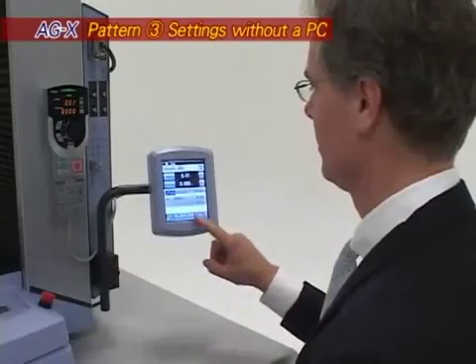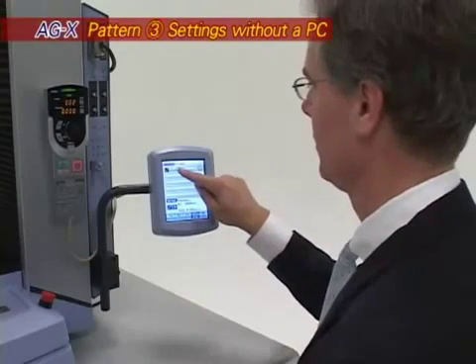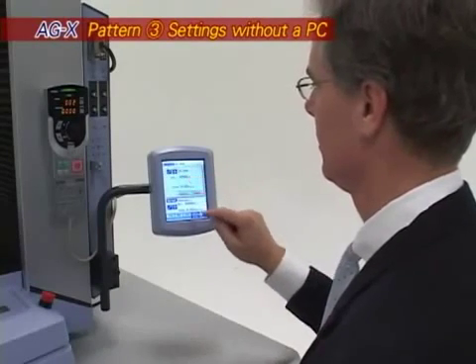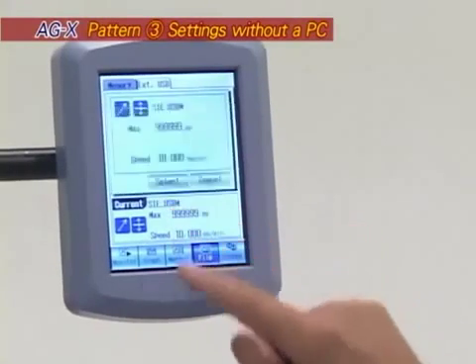Using only the operation controller, enter condition settings and perform testing without a computer. Easily change testing speed and many other parameters.